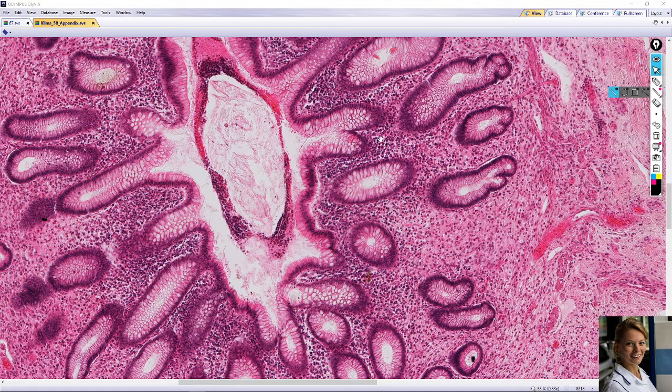The lamina propria contains loose connective tissue and intestinal glands. This is a straight tubular structure, also called crypts of Lieberkühn. These glands are not so deep, and there are fewer than in colon.